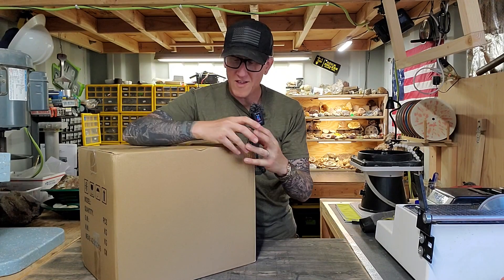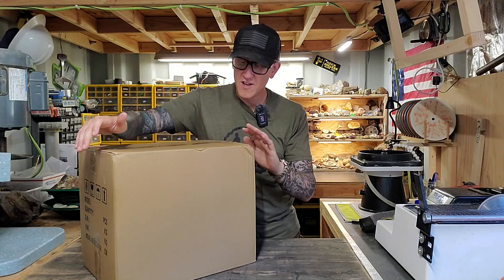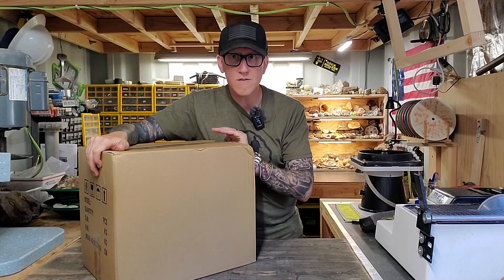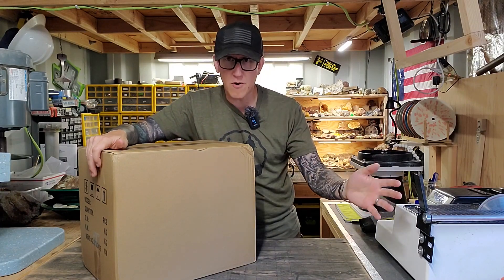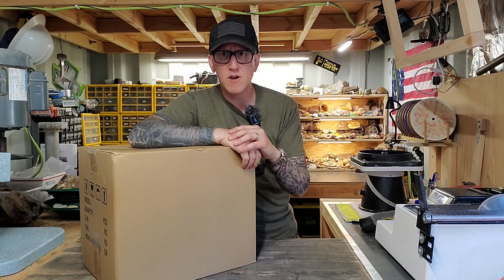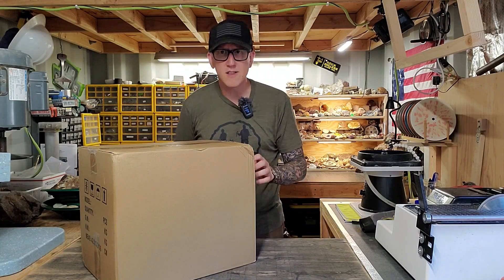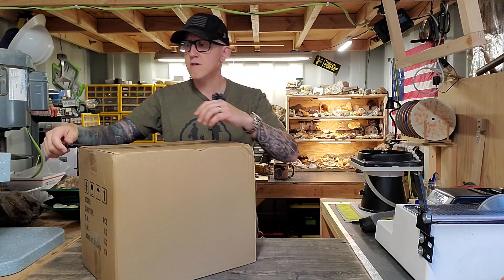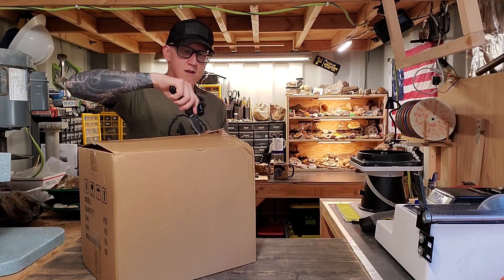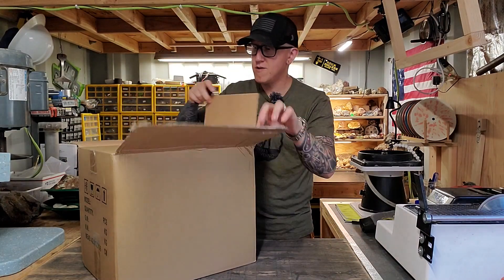Welcome back to the channel everybody. I got something really fun here — I'm very excited about this. This is a donation to the channel from a major supporter of the project and everything I'm trying to accomplish here. James sent me this amazing package. Let's get this thing open. I think this is gonna be a really big help in some of the stuff I want to do here on the channel.